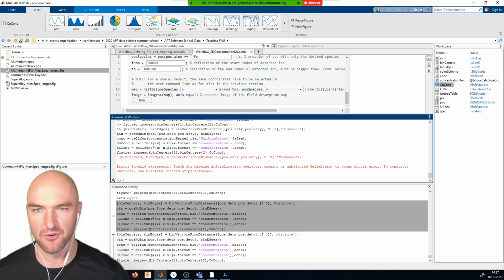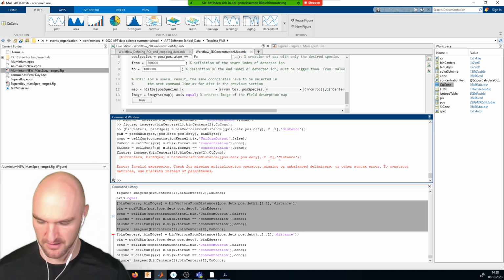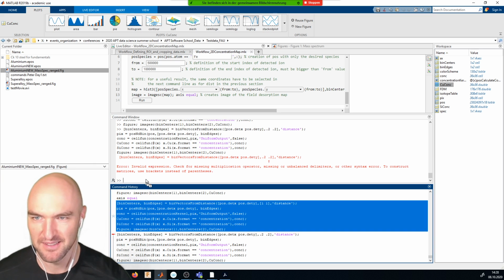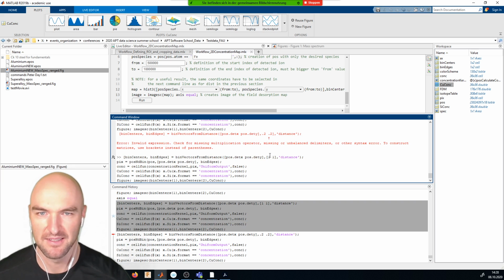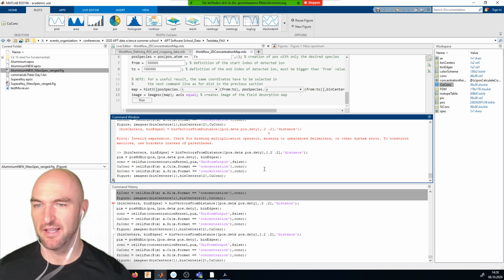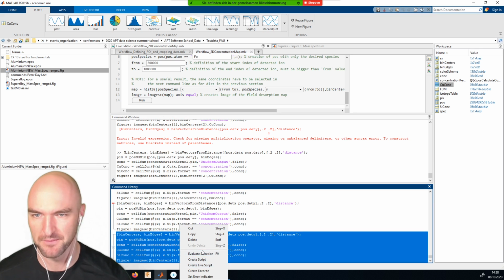And then I can rerun the... Did I do something wrong? Oh. Of course I did something wrong. What else? I deleted one of the brackets. And now we rerun the whole thing. And this is really the power of having everything scriptable, okay?